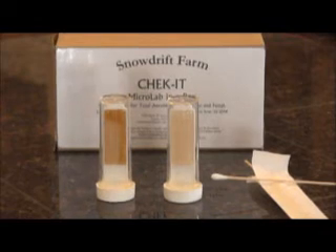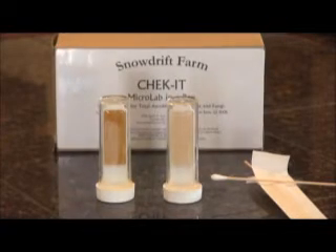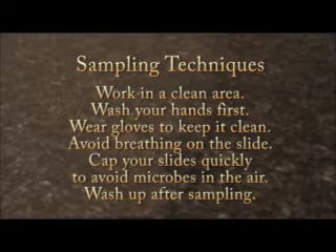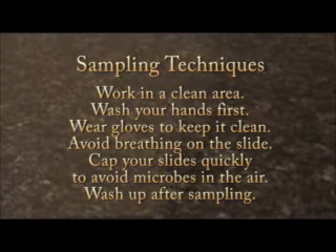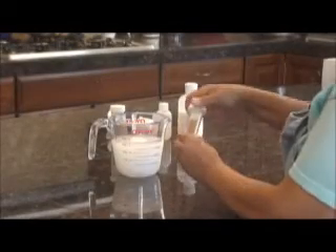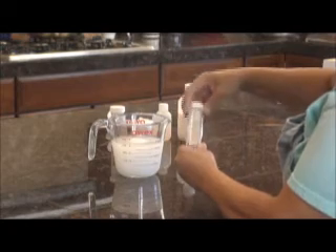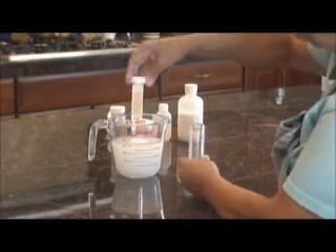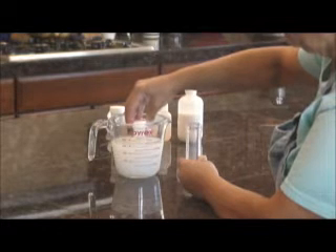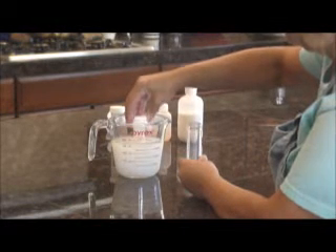Sterile swabs are included in the kit to allow easy sampling of products like lotions. We will demonstrate how to use the Check-It test kit for a variety of different products. Two different sampling techniques can be used depending upon the product being tested. Liquids, like soaps and herbal astringents, should be sampled by dipping the slide into the liquid and holding it there for about five seconds. Allow the slide to drain and place it in its cover.